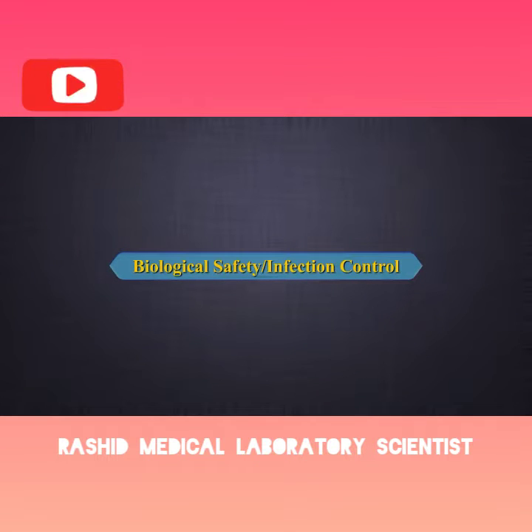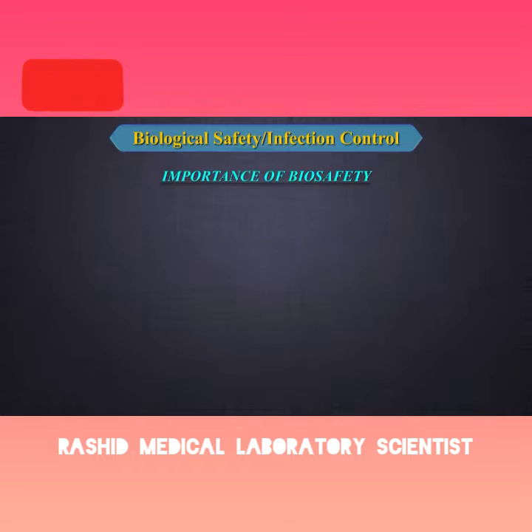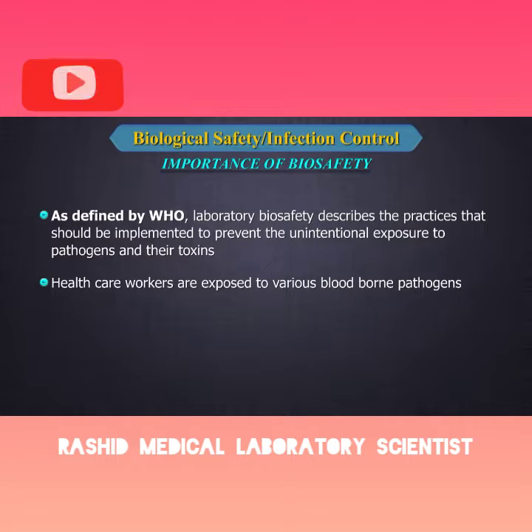Biological safety and infection control. Let us study these two topics today. What is the importance of biosafety? As defined by the WHO, laboratory biosafety describes the practices that should be implemented to prevent the unintentional exposure to pathogens and their toxins. Healthcare workers are exposed to various blood-borne pathogens, for example, HIV, hepatitis B, hepatitis C, etc.